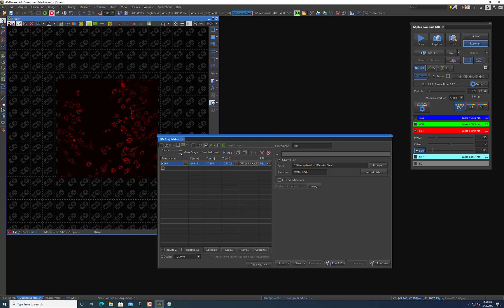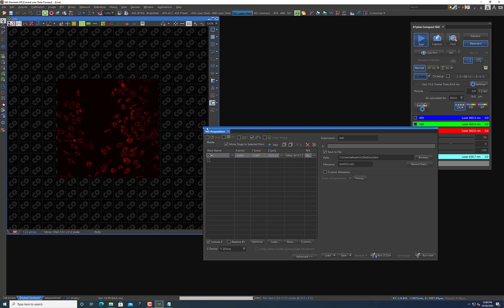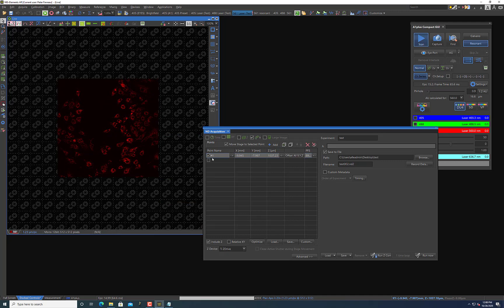I'm also going to select this 'Move stage to selected point' because what that will do is if I press this button here or click on any of the positions I select, it will move the stage automatically to that position. So let's go back here and let's try looking for a few more positions just to note them.